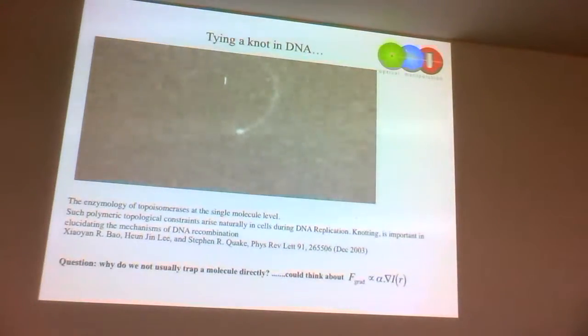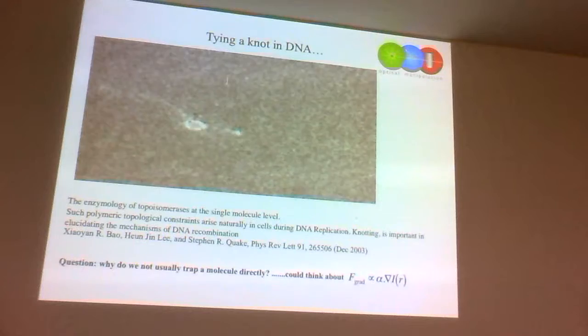Here's an example. This is Stephen Quake's group at Stanford tying a single piece of DNA in a knot. This is lambda phage fluorescent DNA with two beads attached. And because DNA is negatively charged, they can't actually tie a knot tightly enough.